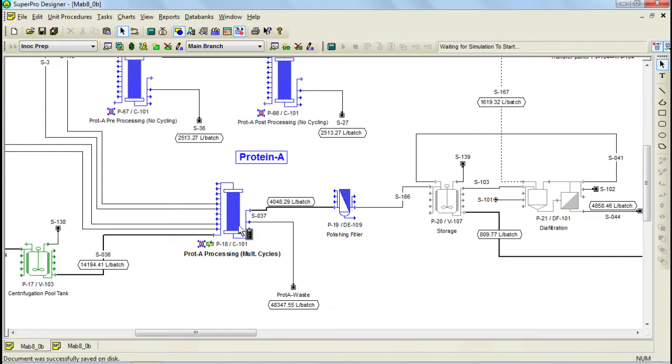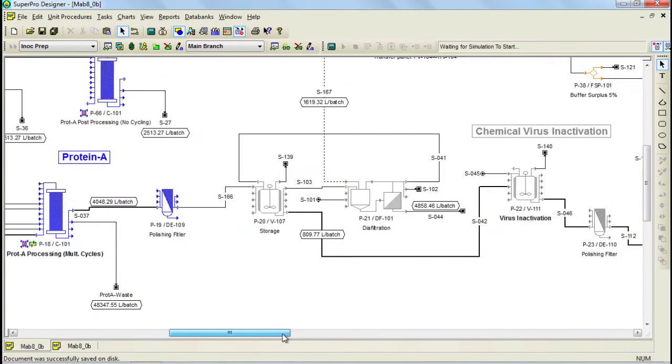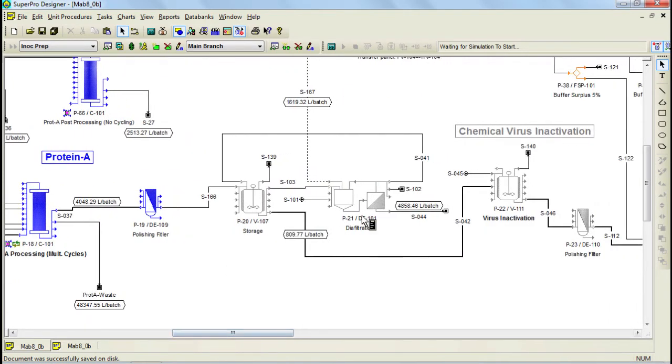Following chromatography, the product is collected in a vessel and then it is sent to a diafiltration unit where it is concentrated and diafiltered. The concentrated solution is then treated for one and a half hour with a detergent to inactivate the viruses.